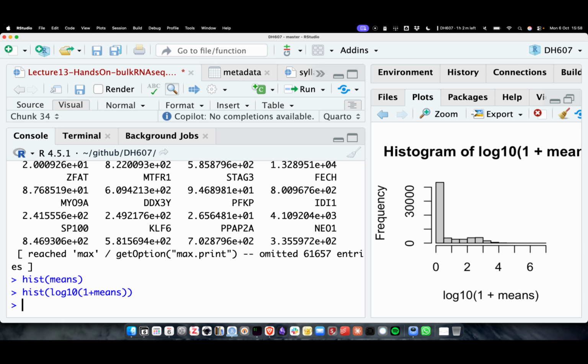Last class I told you that there are two things that you should always measure given a counts matrix. What is the other thing? This is the mean of the rows.